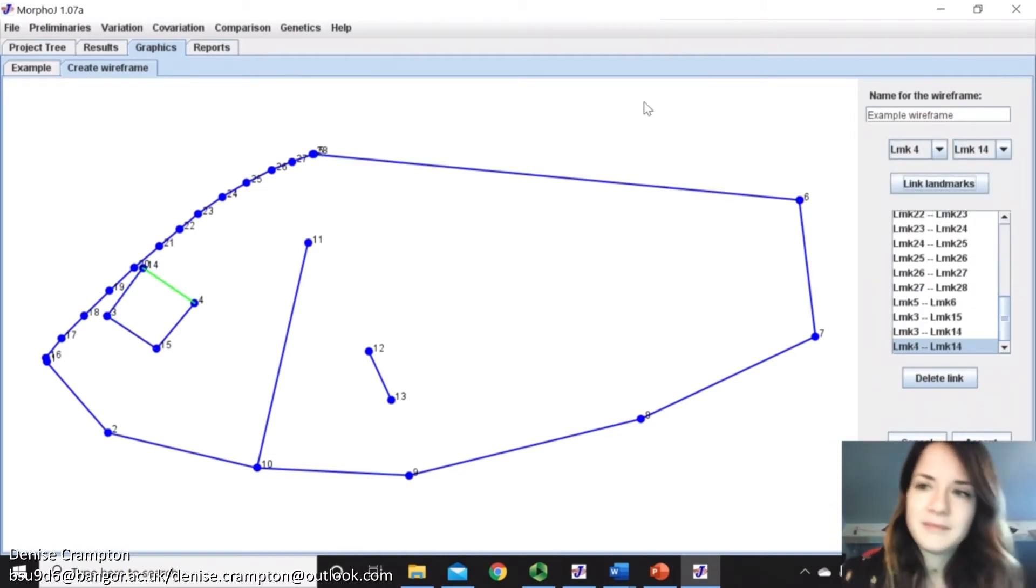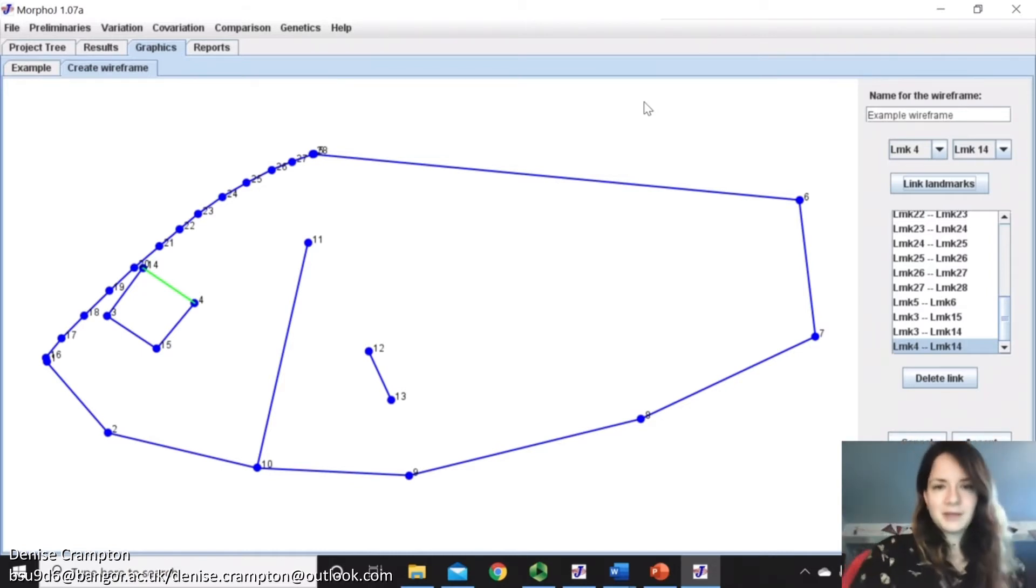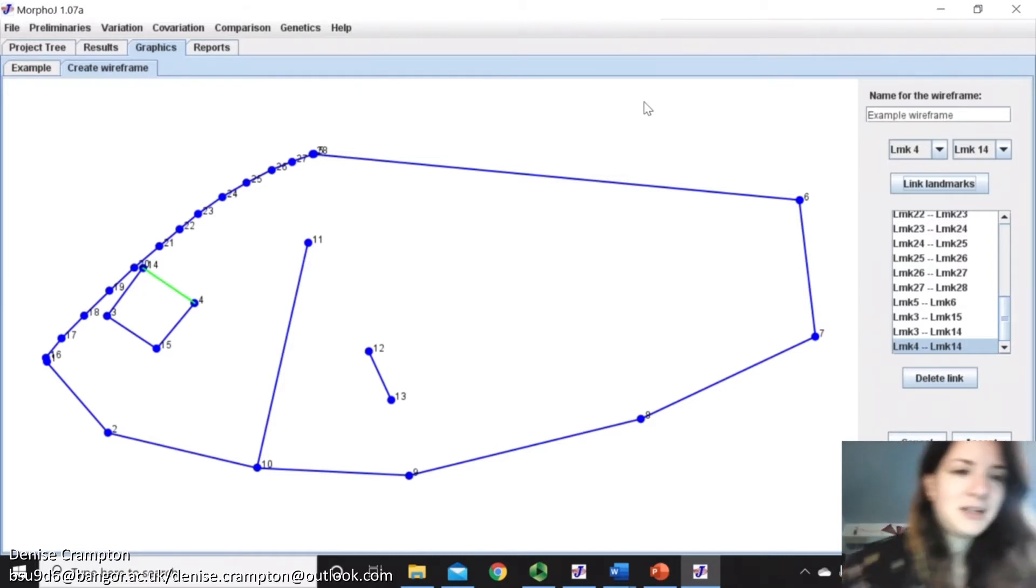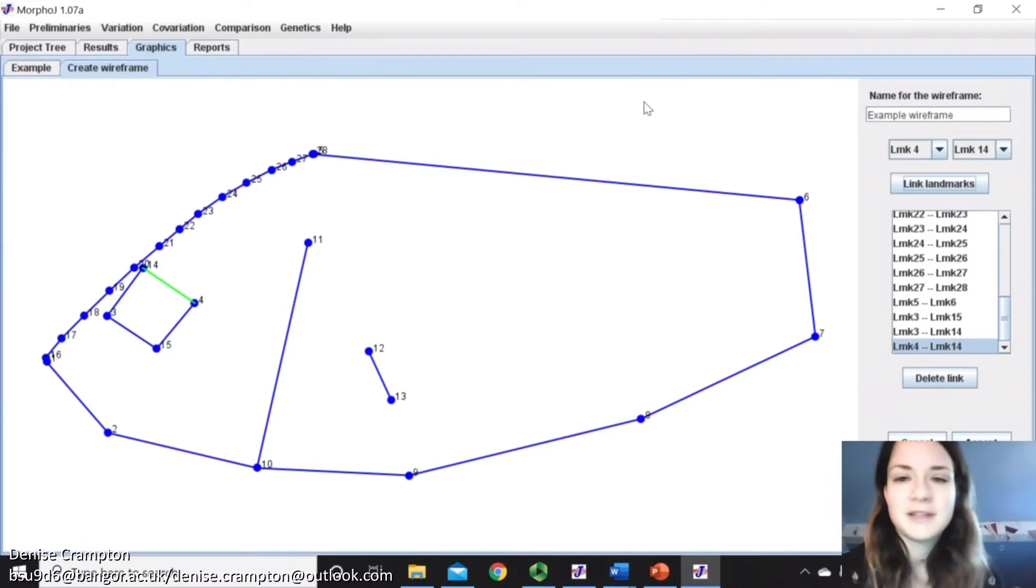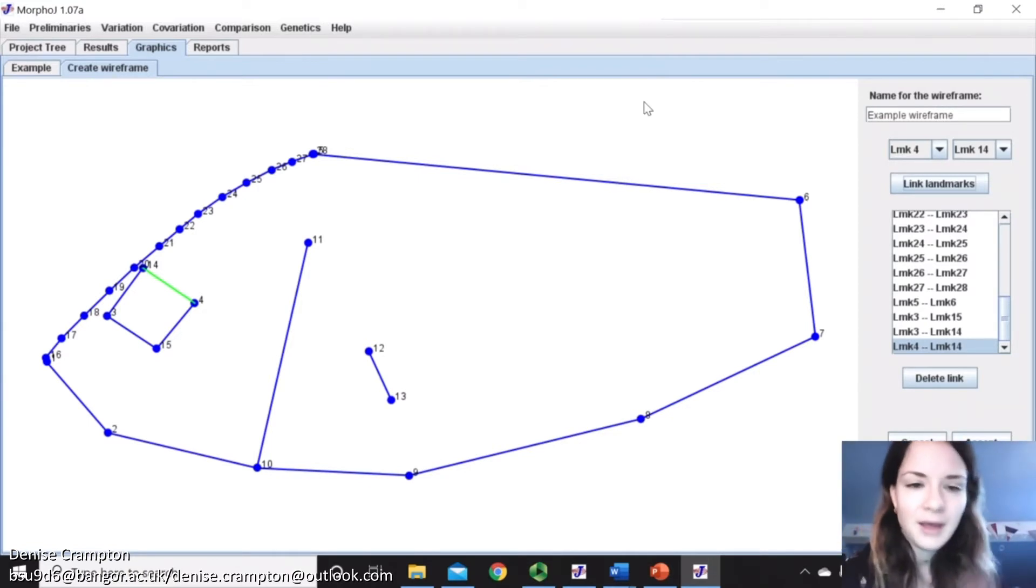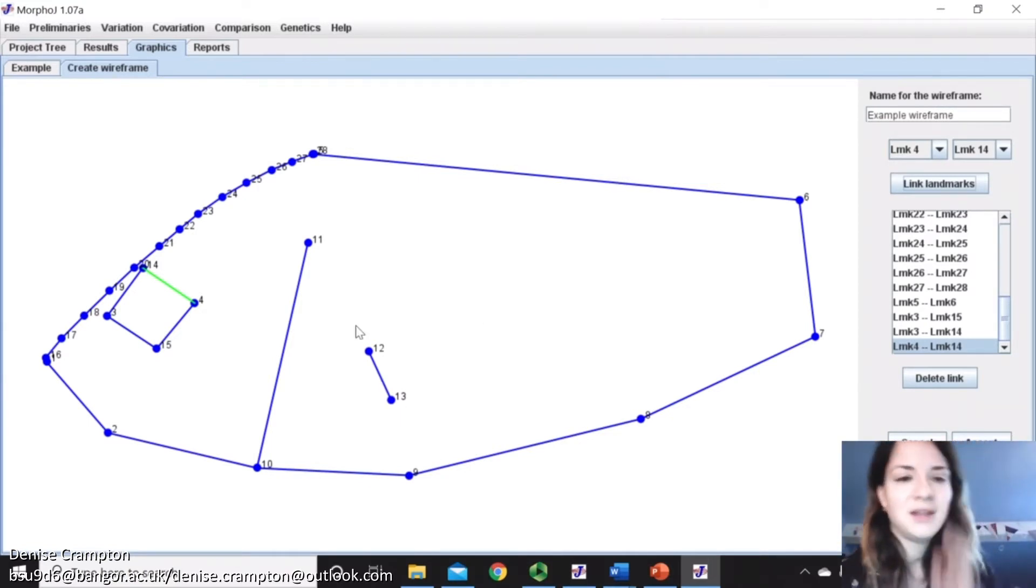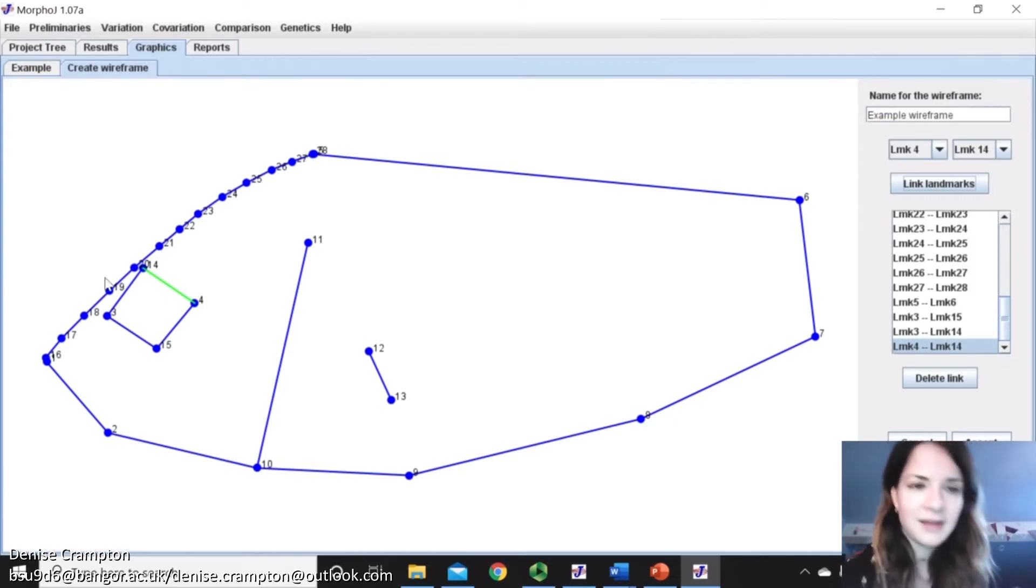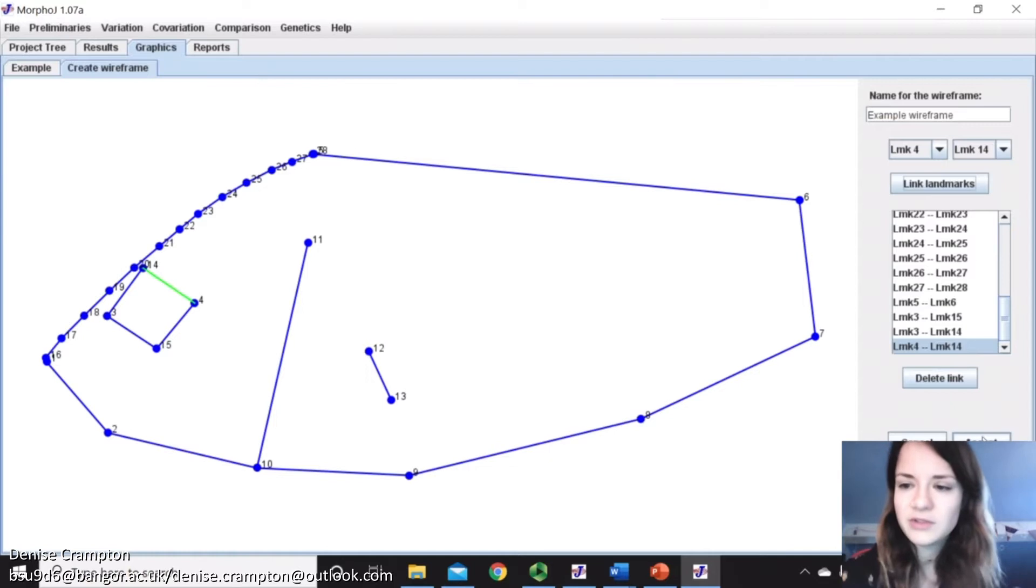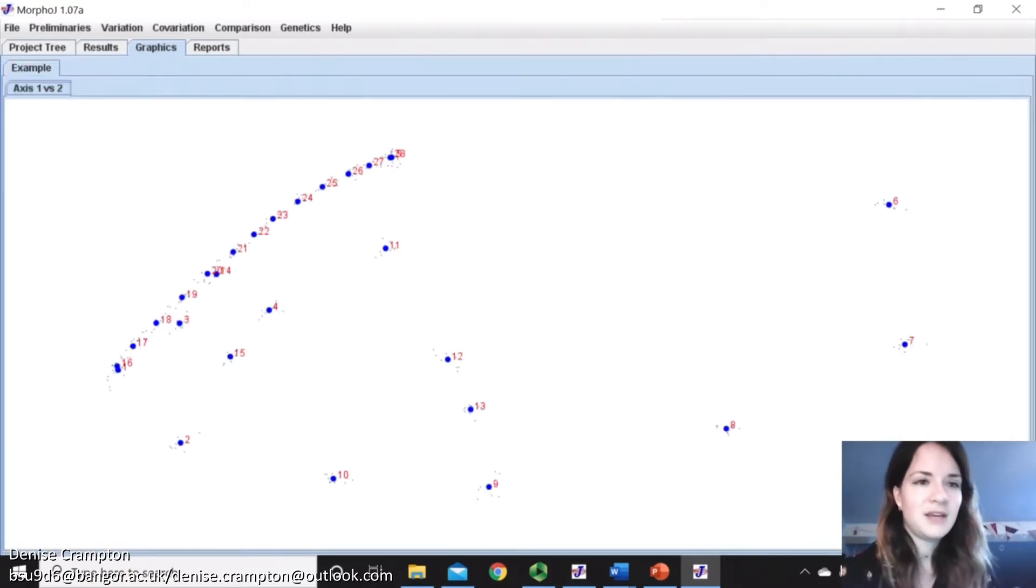So that's my wireframe template done. It can be quite a laborious task, but once you've done it, you only need to do it once. You can see I've represented the overall body shape. I've got the pectoral, the fin origin there, the operculum and the eye, which I think is a good way of visualizing it all. So you just click Accept and that is now saved.